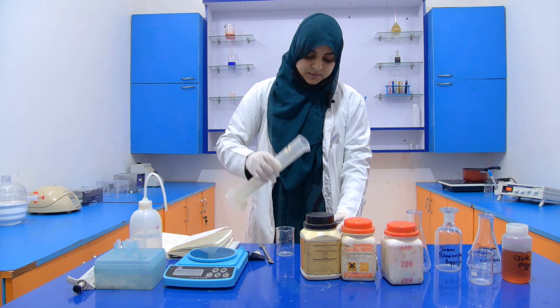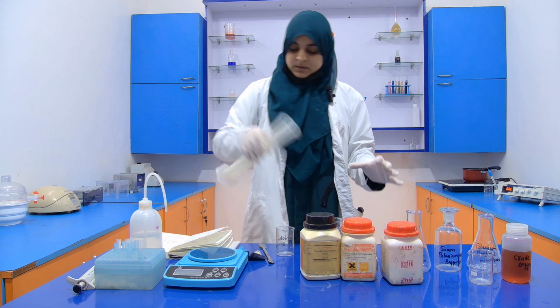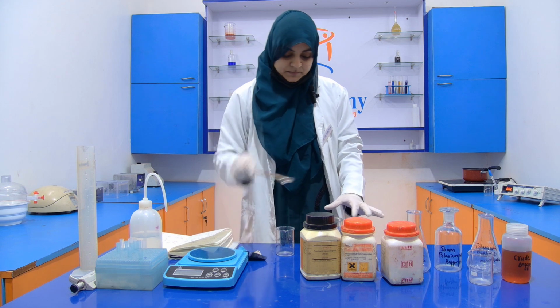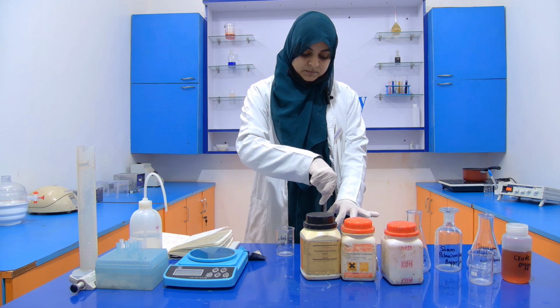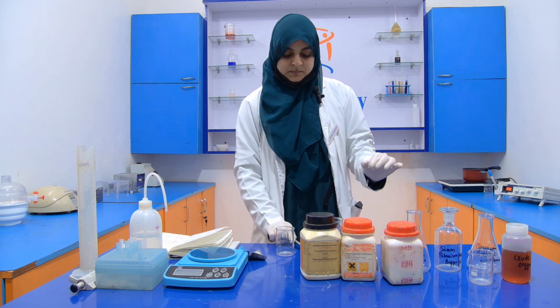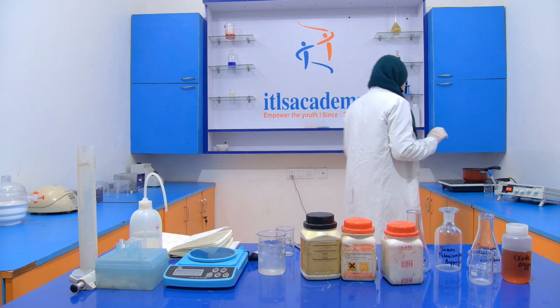This is your 100 ml. So 2% sodium bicarbonate is ready. Still, it is not boiled.